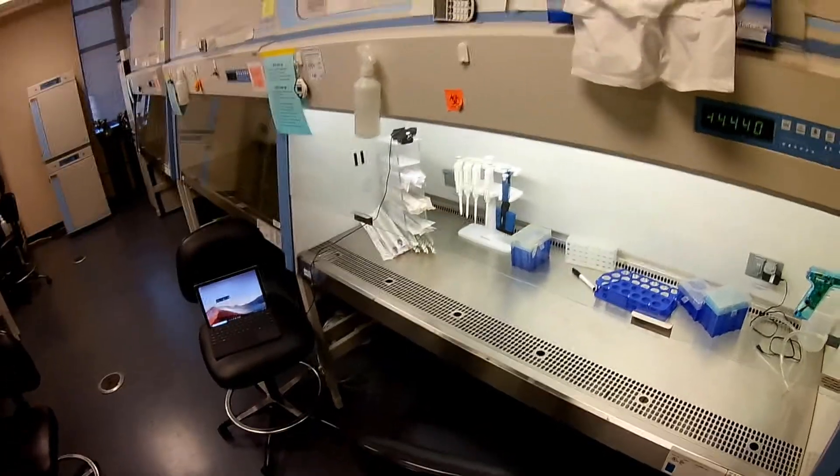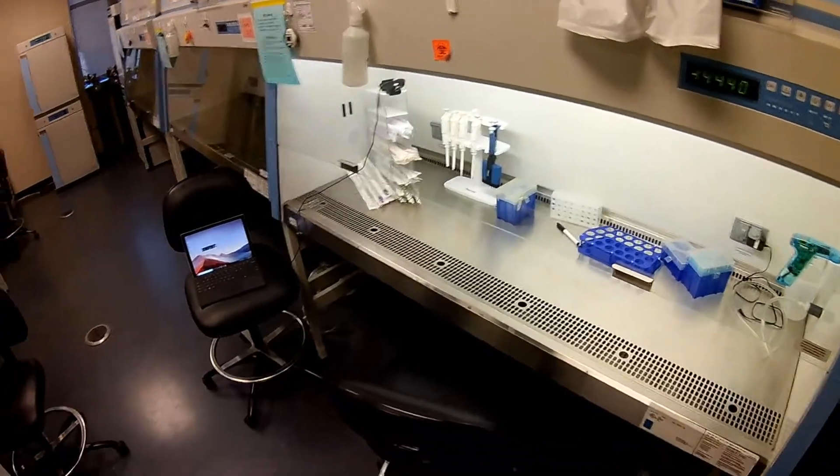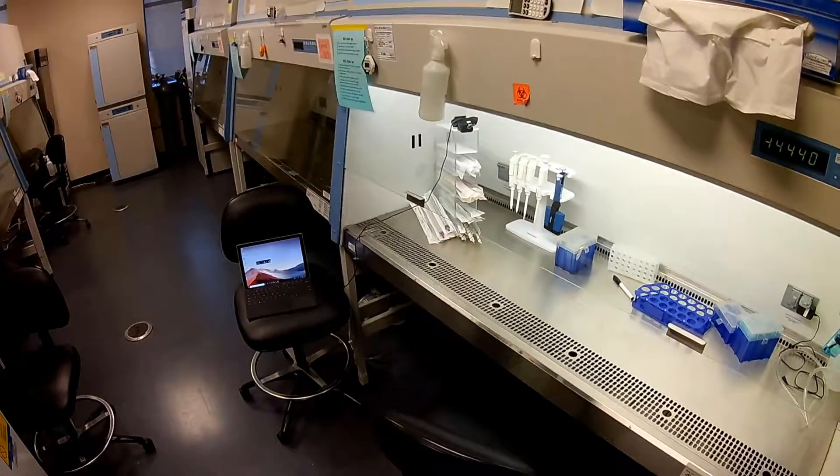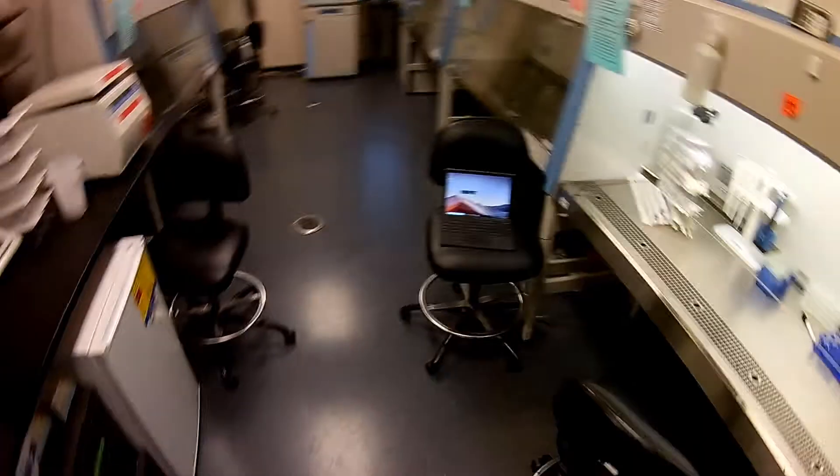Hi everybody. This is day three since I first seeded the cells. I consider the first seeding day as day zero. Then on day two, which was yesterday, I went ahead and fed the cells like you saw in the previous video.